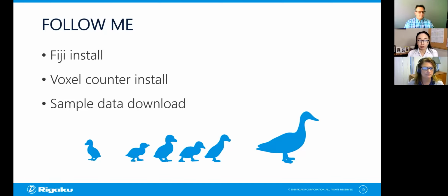If you don't have them yet, just enjoy the workshop, and you can watch the recording later to give the same analysis a try by yourself. Okay, now let me switch the screen and let's get started.